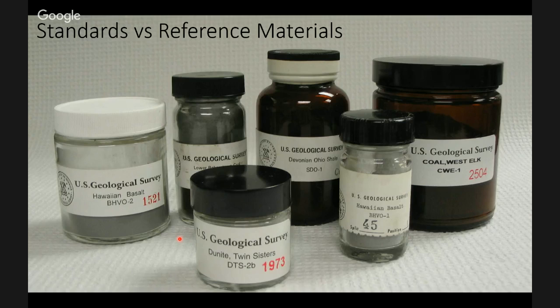So you would measure these along with your samples, and then you would check that you're getting the right number. And when you report your results, you'll also report the ratios or the concentrations that you get for these standards. So people from other labs, when they see your data file, they can see that you're getting good quality data.